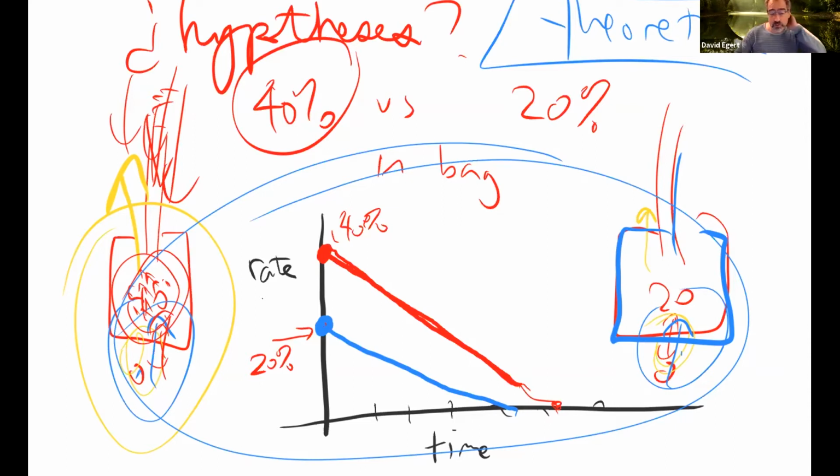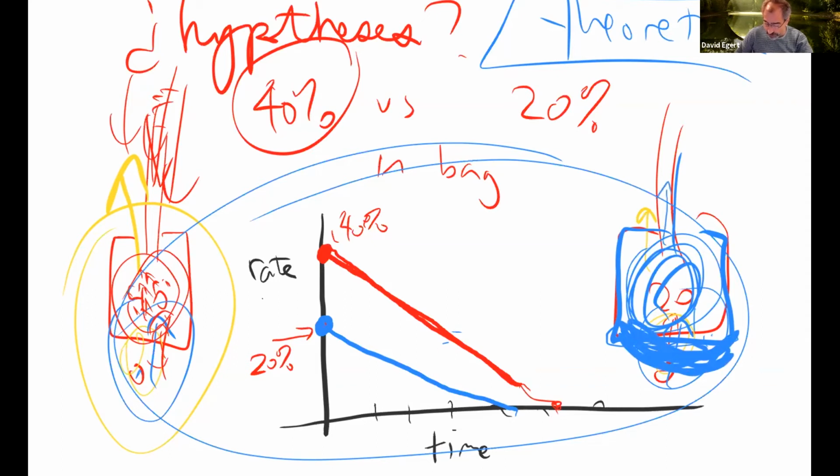Again, what other sources of variability can mess with this? Measuring with the ruler, measuring errors, can be a big problem. Depending on how tight this thing is, the little thing could pooch out. It might be filling with more water, but this thing is becoming more distended. So instead of water going up the tube, we're just getting this thing blowing up a little more, like a balloon on the bottom. So there are lots of things that can go wrong that might not make our final graph look exactly like this.